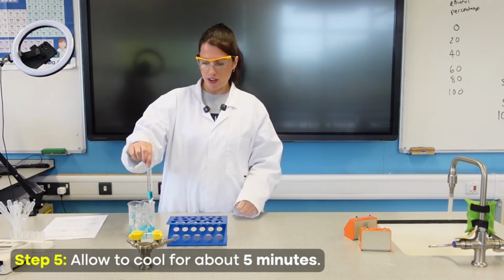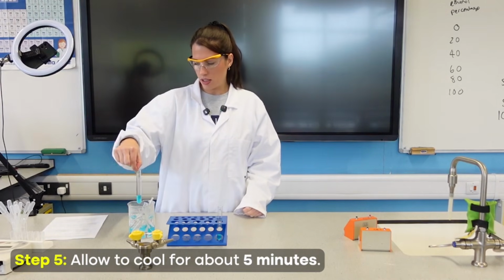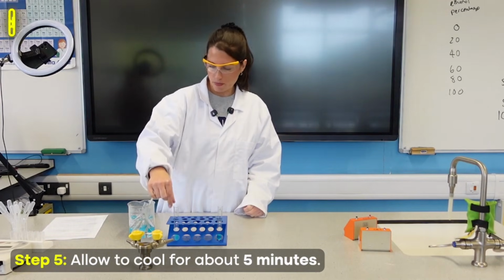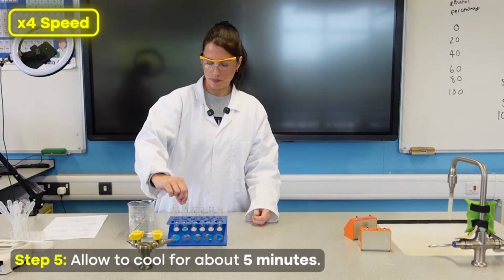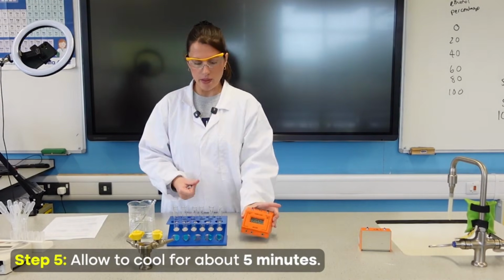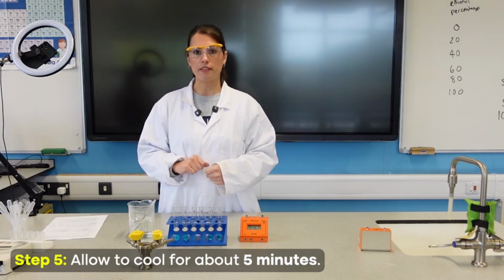So I'm going to take them out, being very careful not to shake, so any precipitate that's formed will start to settle at the bottom. We'll leave it for about 5 minutes, but for this one we can basically just touch it to make sure it's not going to be too hot to go into the colorimeter.